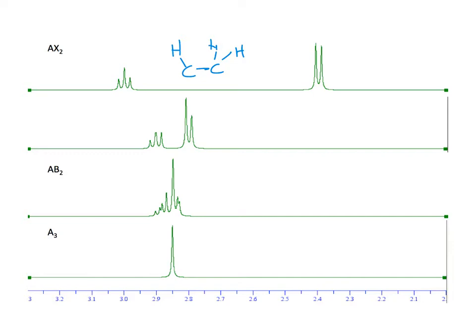There's an H there and there. Okay, so there's one proton on the carbon and two H's next door. All right, so we have a doublet for the two protons and a triplet for the other one. If they're far apart, AX2, we see a 1 to 2 to 1 ratio in the triplet and a 1 to 1 ratio in the doublet, just like we expected.